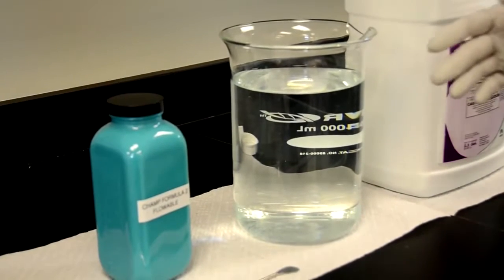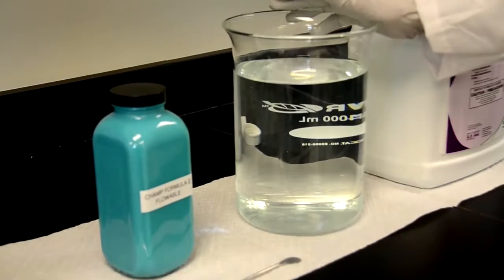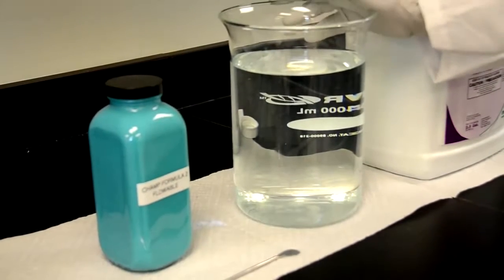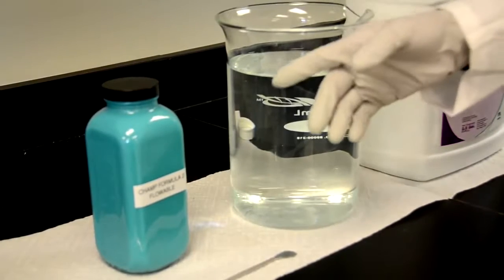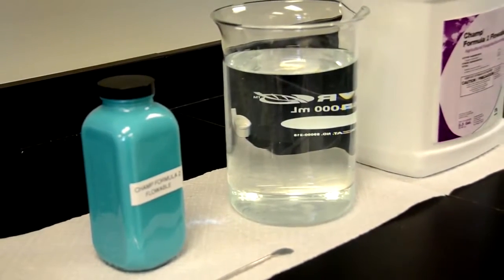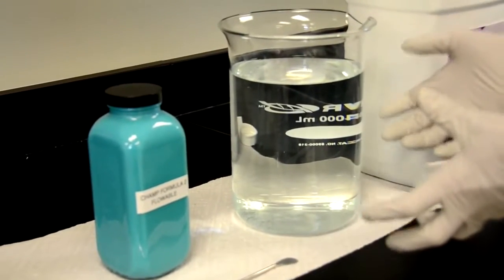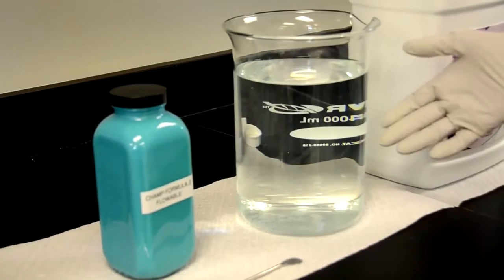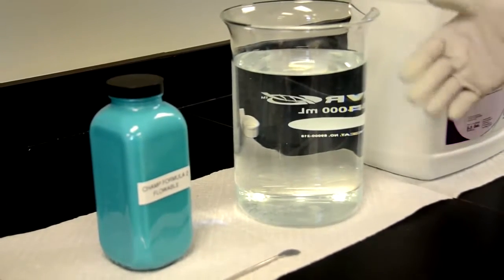What I'd like to demonstrate to you is the dispersion properties of our product. So what I have here is a three liter flask of tap water and I'll take our product and pour it into the water and show the bloom that results. This is the rapid dispersion of our product as it goes into water. This would be similar to what happens when it's used in the field.